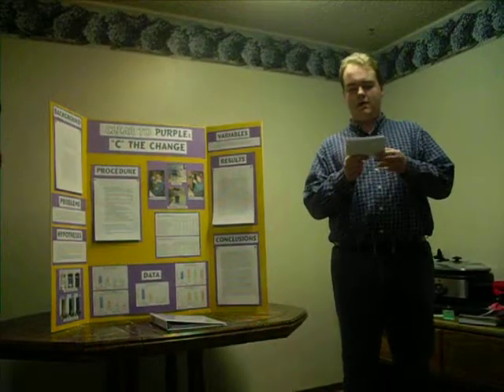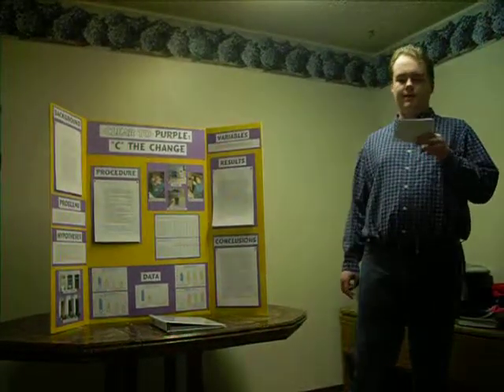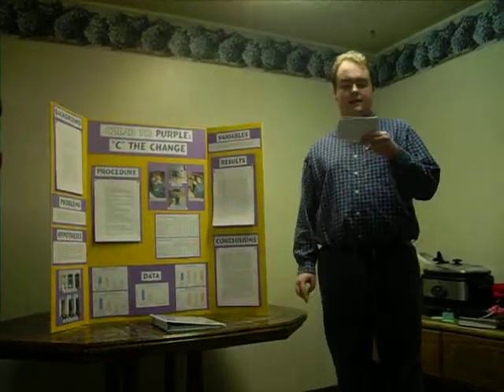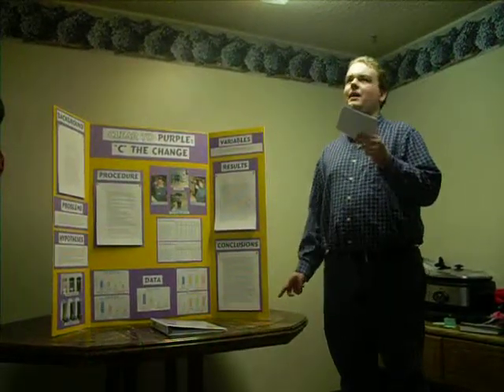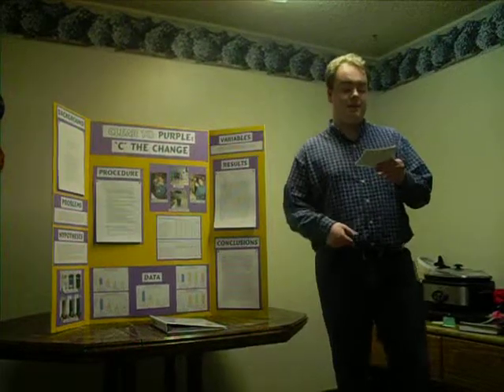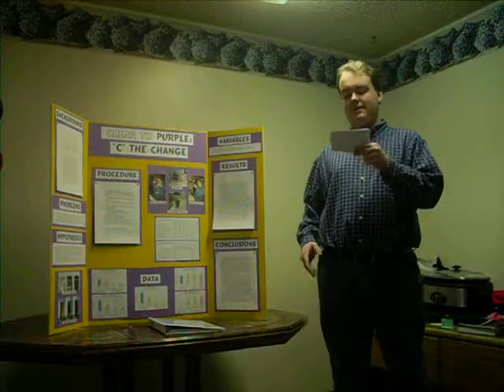For the vitamin C one, I hypothesized that adding iodine would be the most effective of the three options, followed by adding hydrogen peroxide, and that followed by adding temperature. The reason I hypothesized that is this: the temperature difference is not as great of a ratio as, say, the amount of hydrogen peroxide difference and the iodine difference when we deal with it in terms of Kelvin. And the reason I didn't put the hydrogen peroxide first is I hypothesized that would dilute the actual reactants and thereby counteract itself.